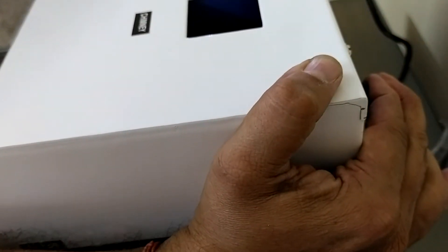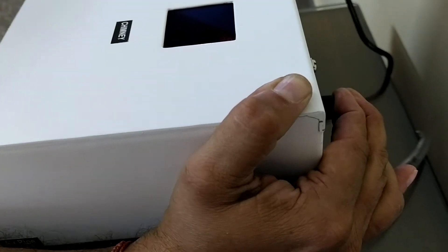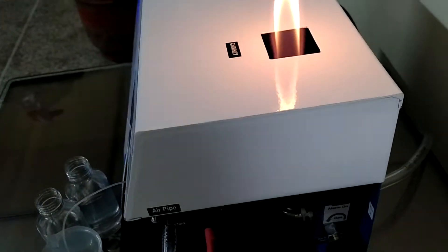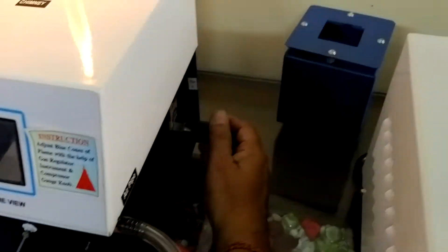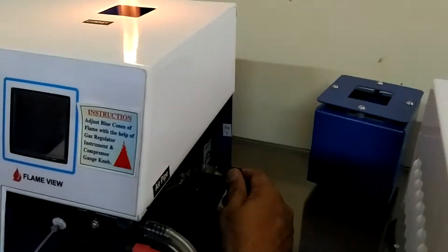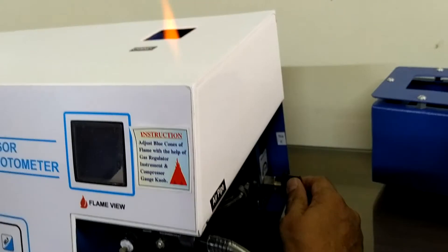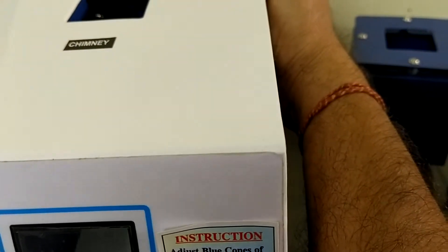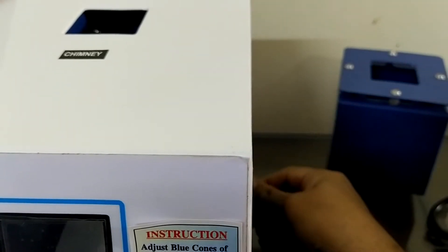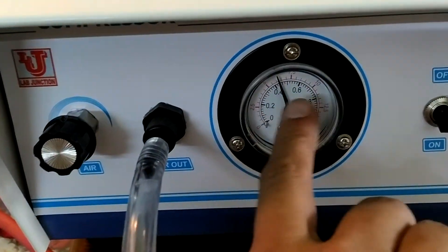Now slightly move the gas regulator one rotation only, and press the manual ignition button on the back side of the unit. The flame should now light. Slowly minimize the gas regulator and observe the flame. Adjust the compressor unit pressure to between 0.4 and 0.6.